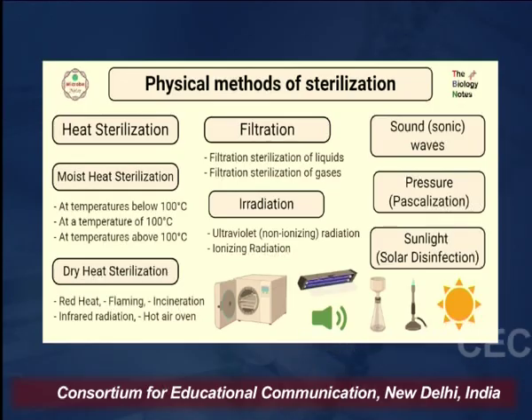First we are talking about heat sterilization. Here, as I told you, we have two subtypes, wet heat sterilization and dry heat sterilization. In wet heat sterilization, we use moist heat, or heat having water vapors, to sterilize the equipment or instruments which are needed for the microbial culture. In dry heat, we use flames without any moisture in order to disinfect the surface or certain instruments. In dry heating, we use the spirit lamp for making the surface red hot.